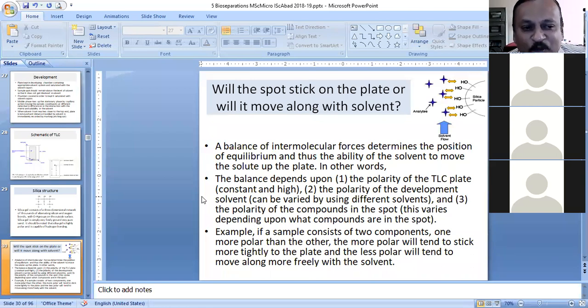My question is, how do you select the best solvent system for a particular separation? Depending upon the sample. Solute and solvent interaction. Anyway, I have not answered this question, and therefore I think I should tell you the answer.